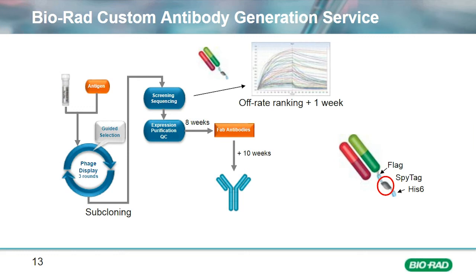customers who wanted a high affinity antibody, they'd be at a sort of crossroads. Do they choose the monovalent format so that they can do affinity work with the Fab and so that they can sort the high affinity Fabs from the lower affinity Fabs? Or do they get the higher overall binding strength format, the higher avidity format, and get the bivalent from the off, but then not have the option of measuring affinity as accurately?